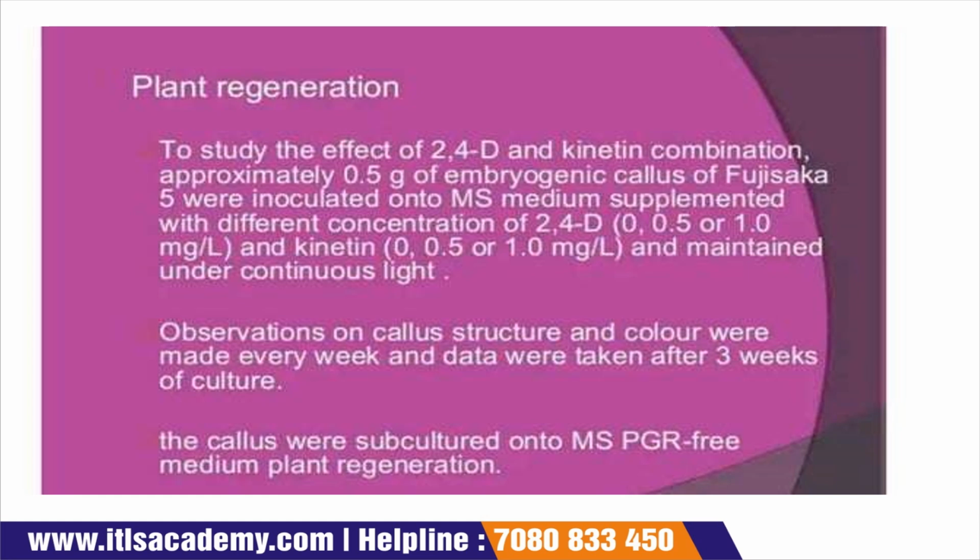To study the effect of 2,4-D and kinetin combination, approximately 0.5 gram of embryogenic callus of Fujisaka 5 was inoculated into MS medium supplemented with different concentrations of 2,4-D, that is 0.5 or 1.0 milligram per liter.